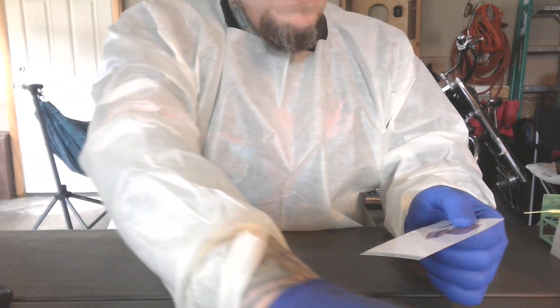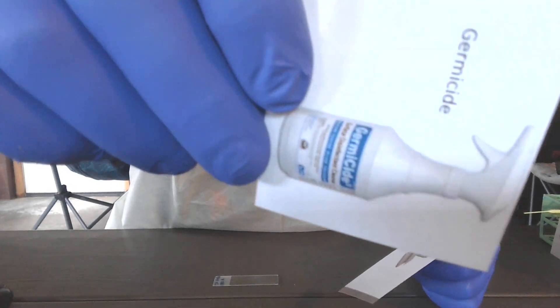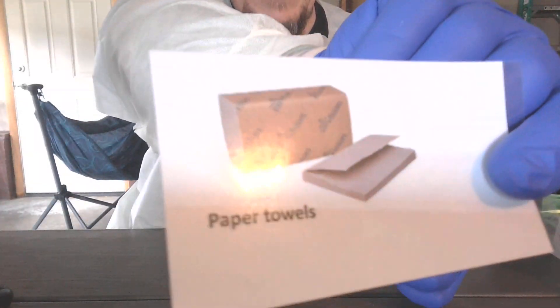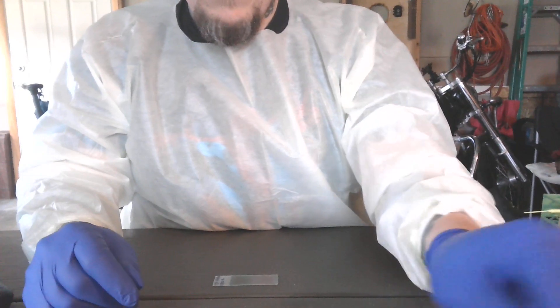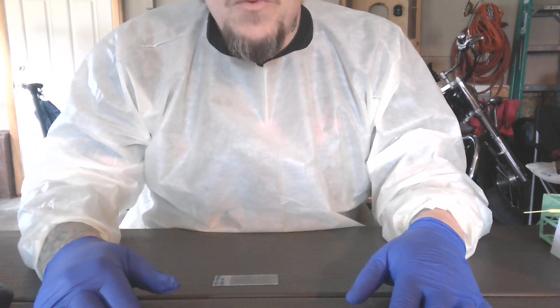You're going to clean your area with the germicide. For that to have an effect, you're going to wipe that down with some paper towels. Then you've decontaminated your workspace.